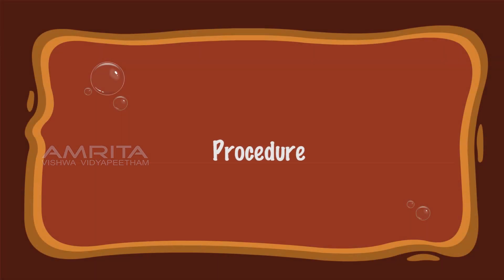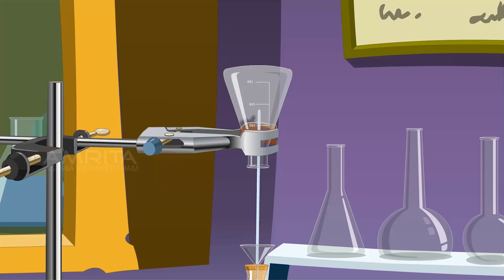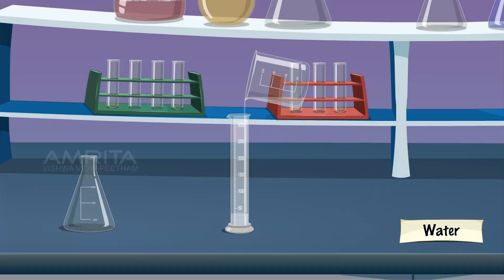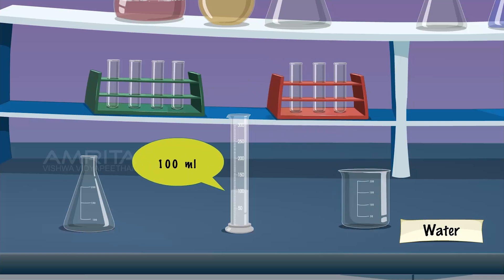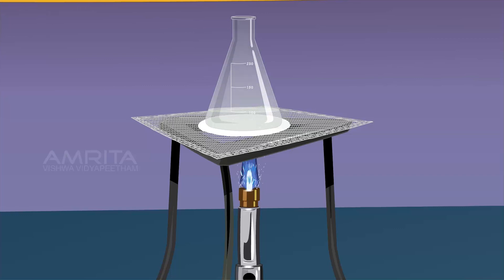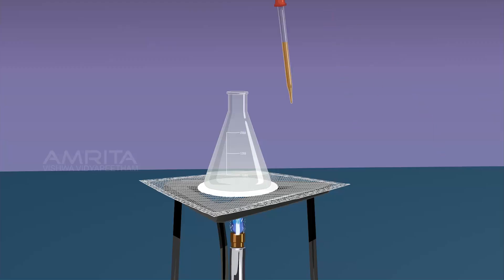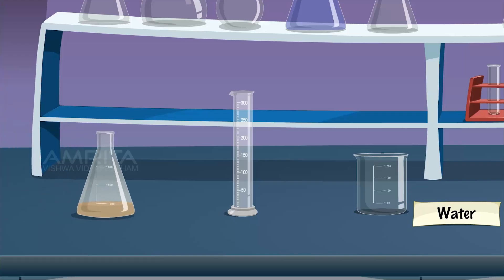Procedure: Take a 250 ml conical flask and clean it by the steaming out process. To this cleaned conical flask, add 100 ml of distilled water. Heat the conical flask containing water to boil by placing the flask over the Bunsen burner. Take 2% ferric chloride solution using a dropper and add it dropwise to the boiling water. Continue boiling until a deep red or brown solution of ferric hydroxide is obtained. Keep the contents of the conical flask undisturbed for some time at room temperature. Label the solution as ferric hydroxide sol.